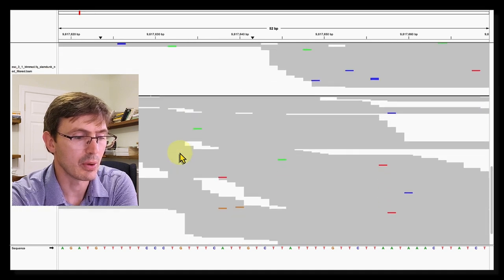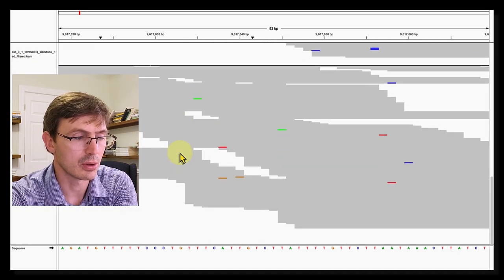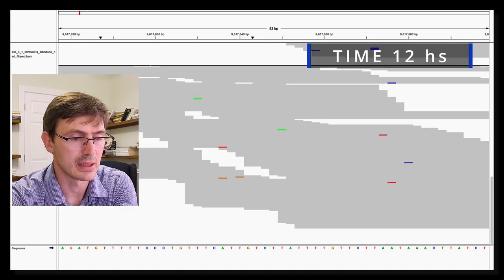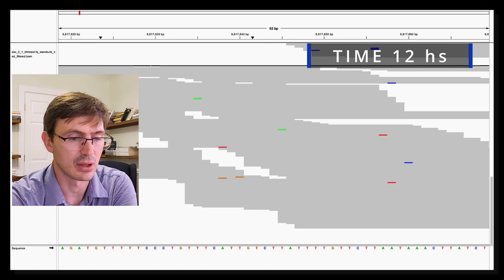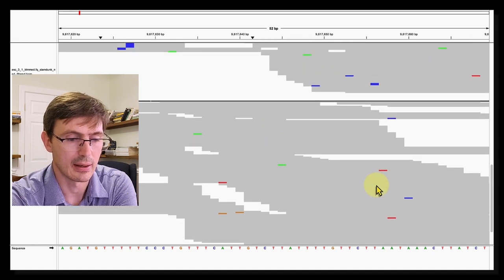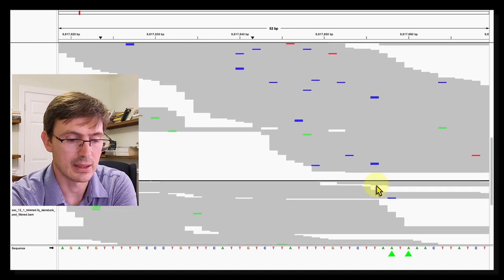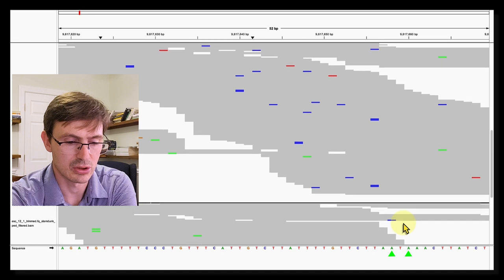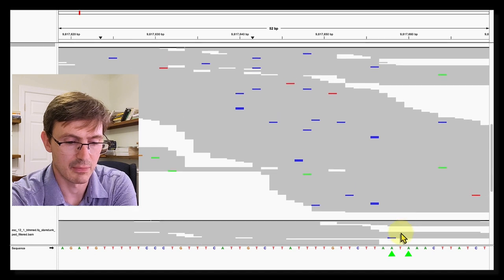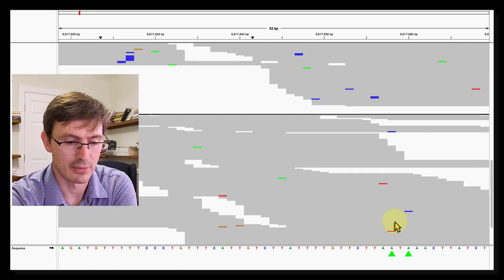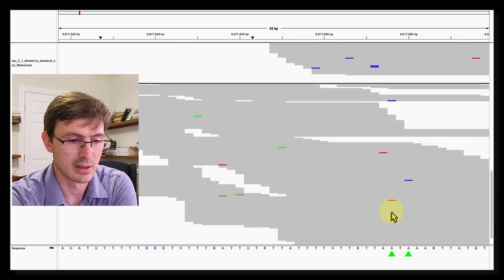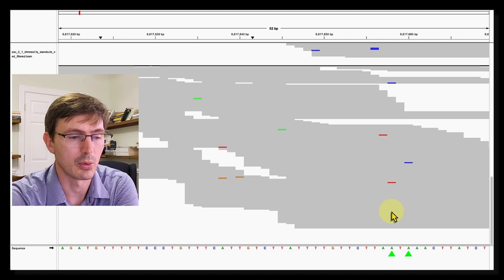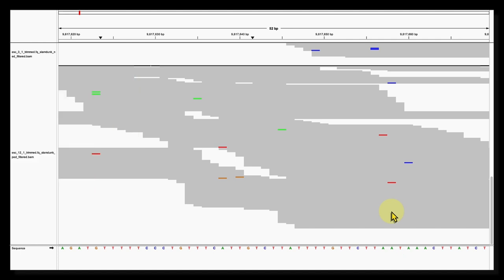And then when we look at the alignment at 12 hours, we see that there is actually very few C mutations. And even in this case, we see that the mutations are coming from these A's rather than T's. So at this point, we don't have any more of our metabolic labeling. So this is what you should expect if you look at the read level.